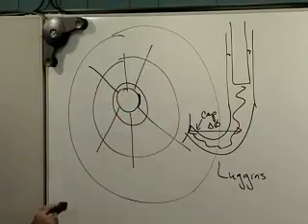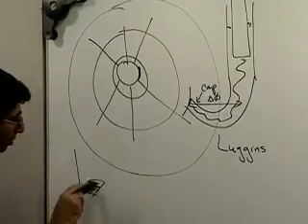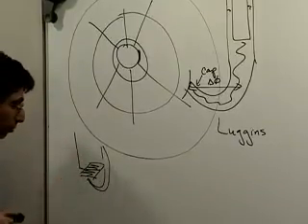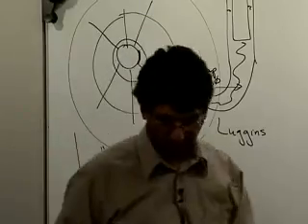But you could imagine I could have a flag electrode, which I do like that, and I could drop my Luggin capillary right below it. And I could get a very good measurement of the electrode potential right there. So if you need a critical potential measurement, that's the way to do it.